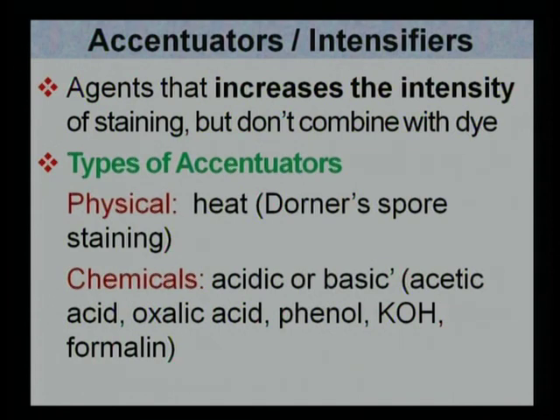Otherwise, the basic aim for either mordants or accentuators is the same. It intensifies the reaction and makes the reaction fast as well as very clear, so that visualization is better. Now, these accentuators can be either a physical one, that is the use of heat, or chemicals.